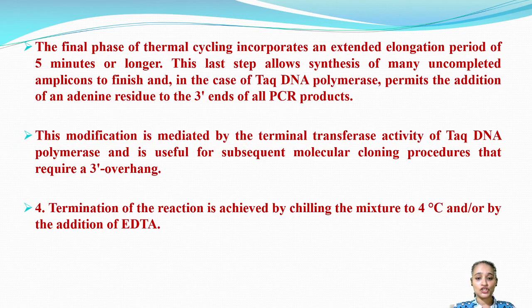Termination of the reaction is achieved by chilling the mixture to 4 degrees Celsius and also by addition of EDTA.